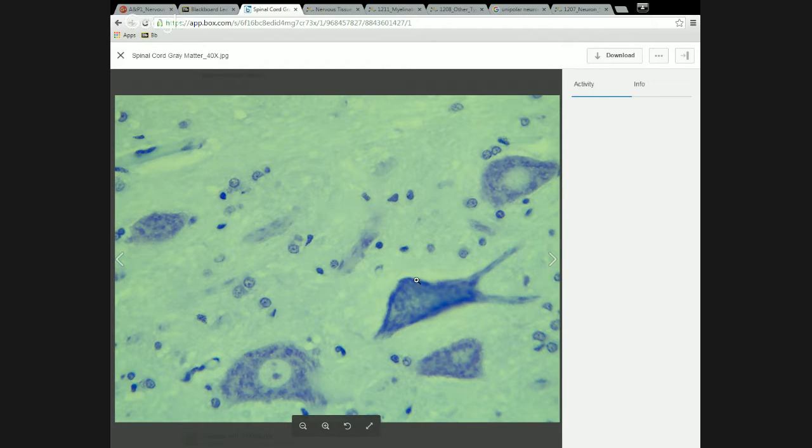So we can see where stuff must be coming off of this. And this particular neuron, for whatever reason, the base of its dendrites actually contains some cytoplasm, so it picks up some stain. But we can look at that and say, okay, there's definitely 3 things coming off of that. And remember, anything more than 2 makes it a multipolar neuron.